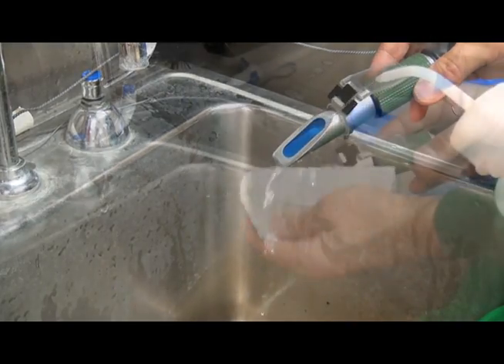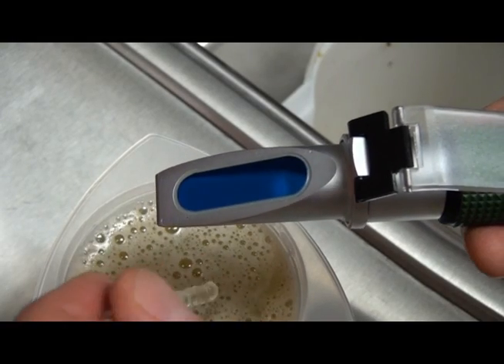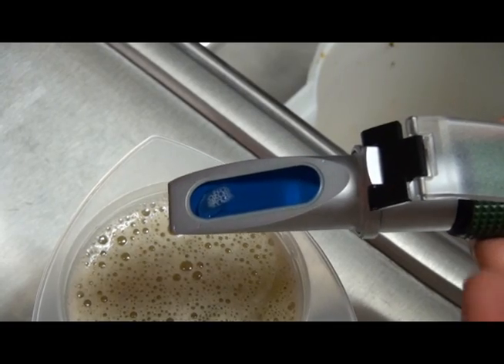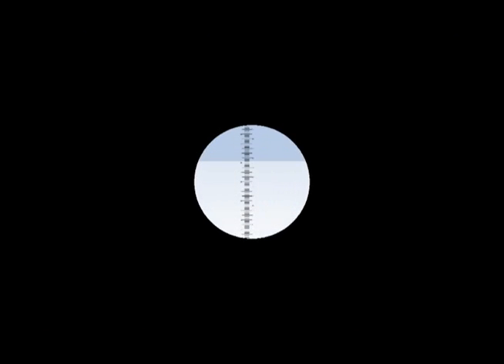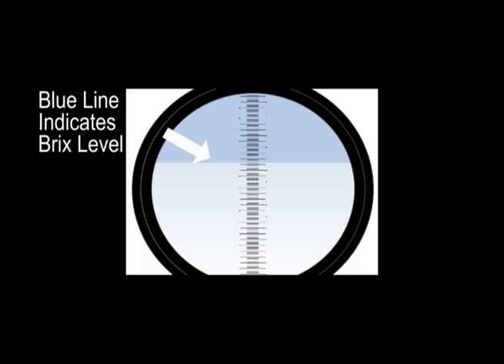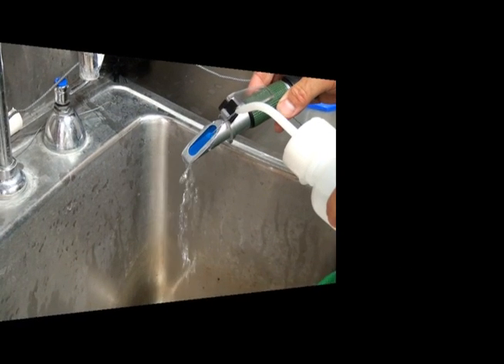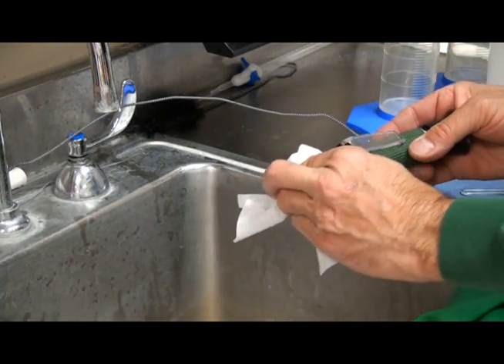To test a juice sample using the refractometer, make sure the prism surface is clean and dry. Place one to two drops of the juice sample onto the prism and close the prism cover. Observe the sample measurement in the viewfinder. The scale is visible through the viewfinder, and the measurement is taken by observing a blue line on the scale indicating the brix level of that sample. Record the sample measurement at the scale point when the blue line becomes solid. Rinse the prism with DI water between samples, and wipe the surface dry with a chemwipe.